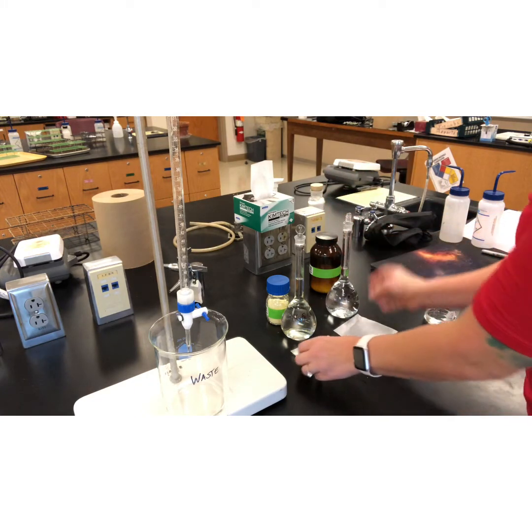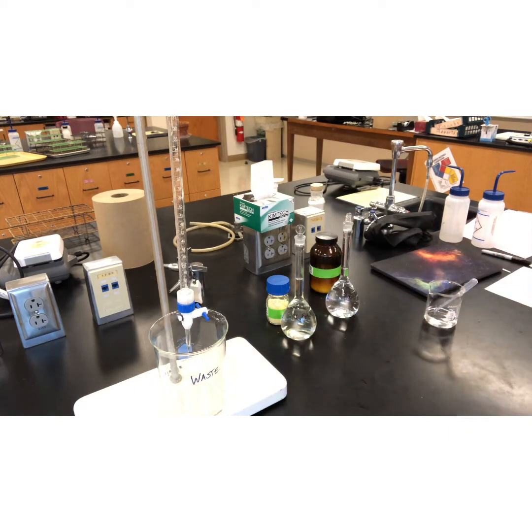Okay, there are my two solutions for part A and part B. We have the same concentrations, we just have slightly different masses. Those masses will be recorded in a Google Sheet of data for you.